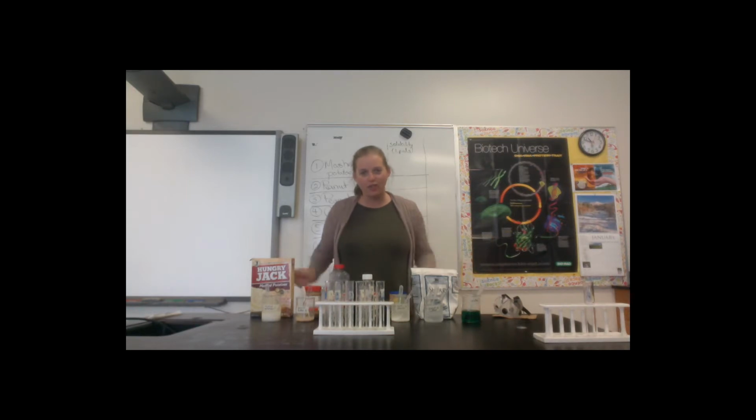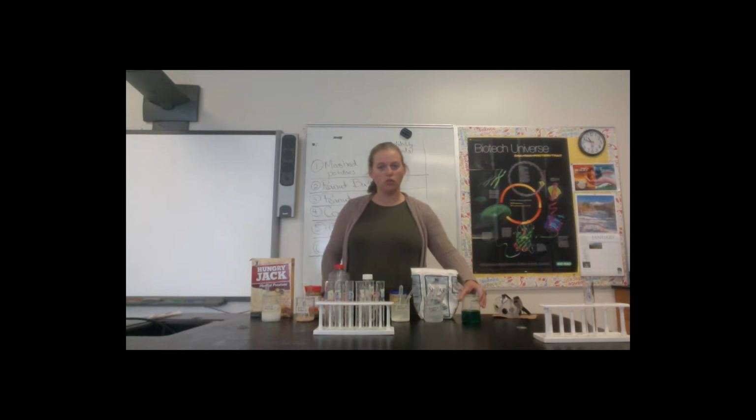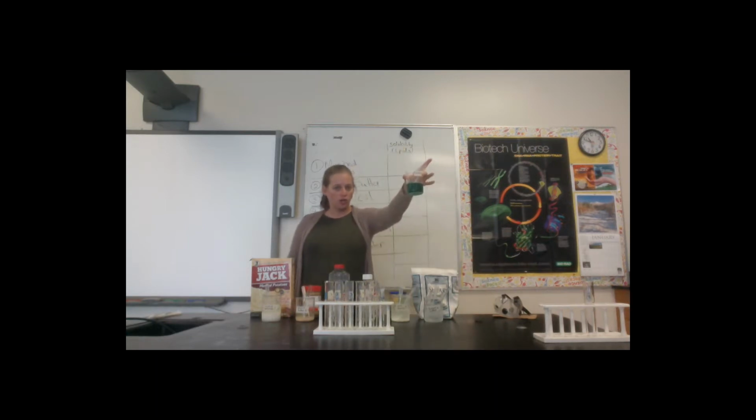Hello and welcome back, ladies and gentlemen, for the final part of your virtual lab where we are testing these 6 foods for macromolecules. Today we're going to be looking for lipids or fats. So just a reminder of the 6 foods that we are looking at. We have mashed potatoes, peanut butter, peanut oil, corn syrup, cornstarch, and table sugar. We are not testing our 2 solvents today. In fact, we are using one of these solvents, the water, to run the solubility test.